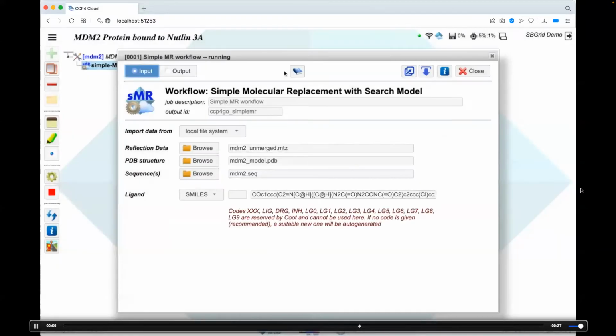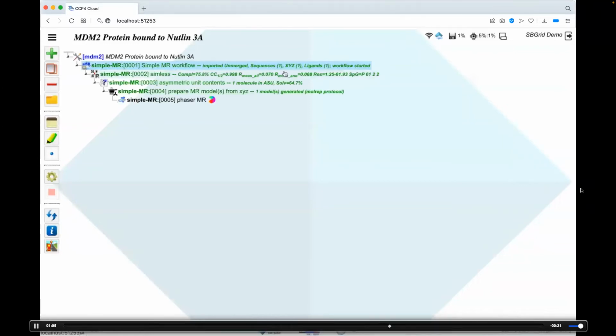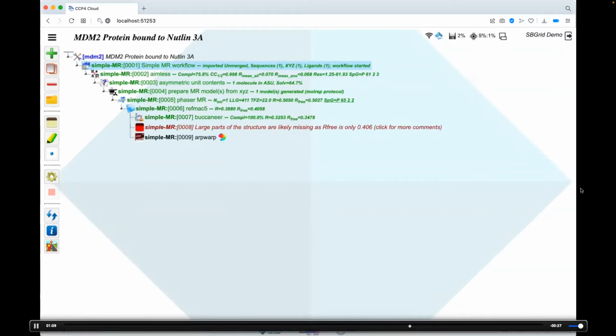Data is uploaded, analyzed, and then the project starts to develop completely automatically without me doing anything. This is all completely automatic. It doesn't go that fast. Of course, there's a movie, but you don't have to be connected all the time. You can switch on and off, and nothing happens. So you can see the project branching, where the workflow tries alternative programs or performs multiple runs for adjusting calculation parameters.